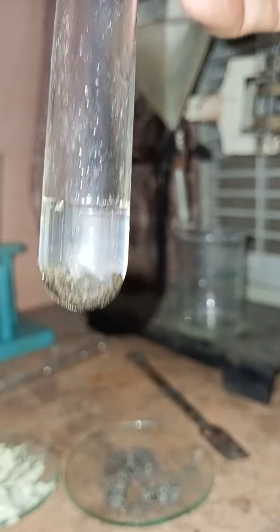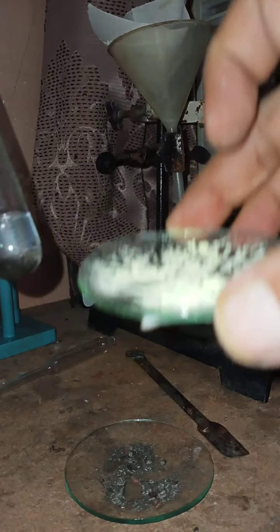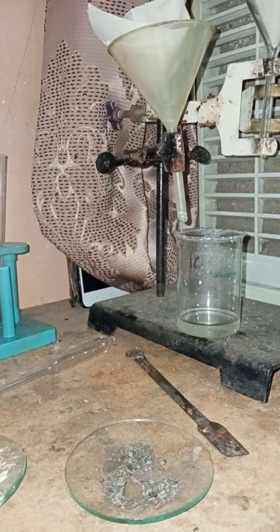So you can easily understand, my dear students, that when the iron sulfide is produced from iron and sulfur, though it has sulfur, it does not show the characteristics of sulfur. Whereas this is the mixture which shows the characteristics of sulfur, and it has dissolved into the carbon disulfide, whereas this does not dissolve into the carbon disulfide. So this is how we can understand.